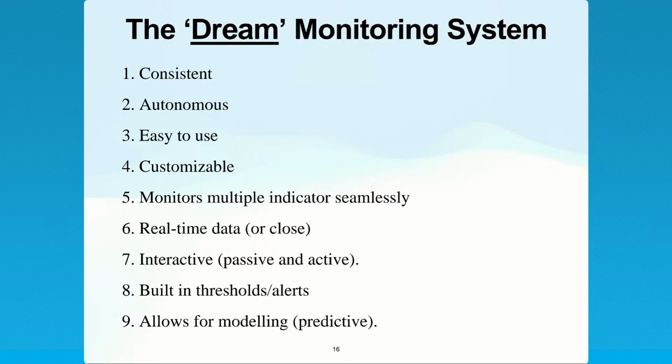And then at the beginning, I need to be able to set thresholds to say when it gets above this, call me. But if it gets below that, don't call me. So I should be able to set those thresholds based on what I like and establish what kind of alert system. Is it email? Is it a text message? Is it something else?